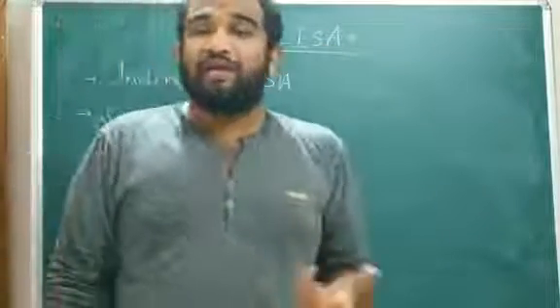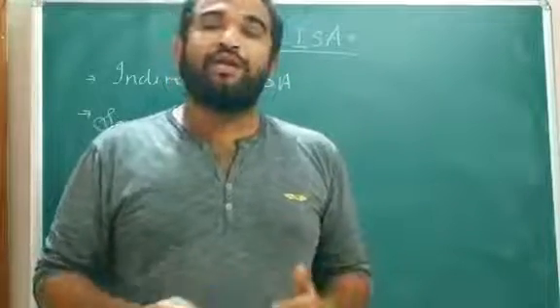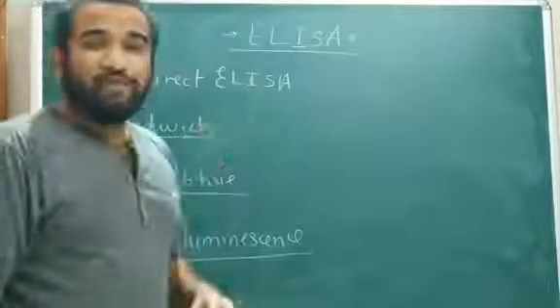Now why the name enzyme when I have not discussed anything about the enzyme? We only know that there is an antigen antibody reaction, but here it is an enzyme linked immunosorbent assay. What is that? We will study. There are different types of ELISA.